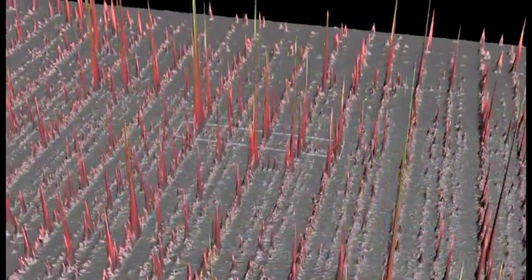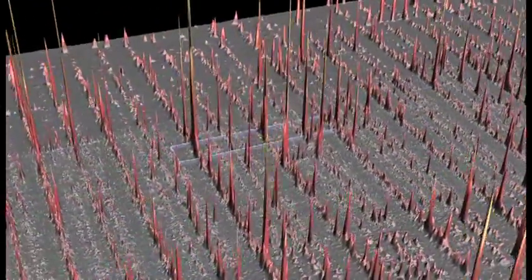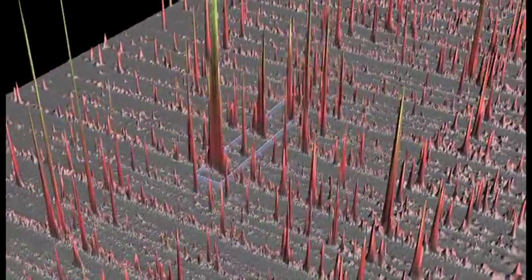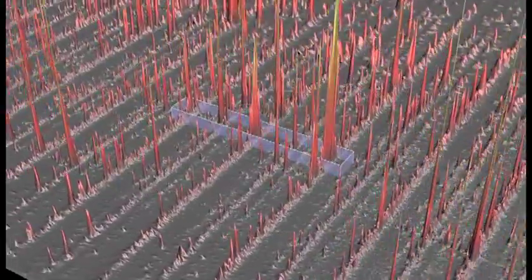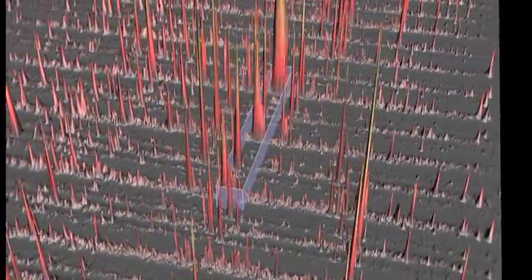Now you can dig deeper and find more at lower levels, no matter how complex your sample. The extra dimension of tri-wave ion mobility provides dramatic enhancements in peak capacity, depth of coverage, and clarity.